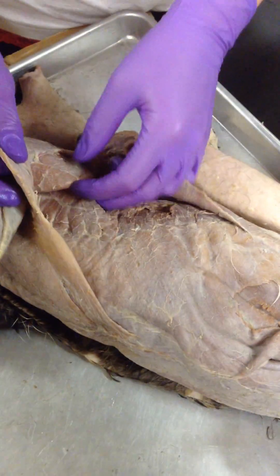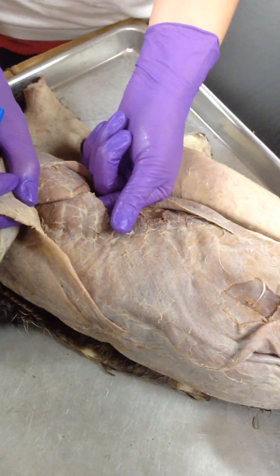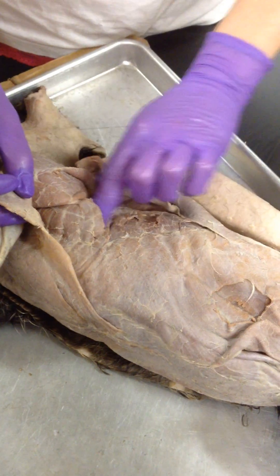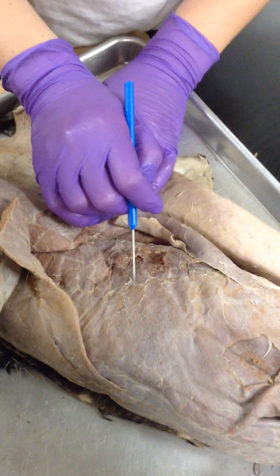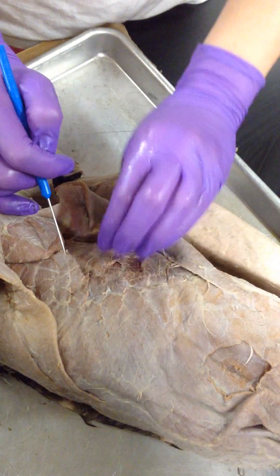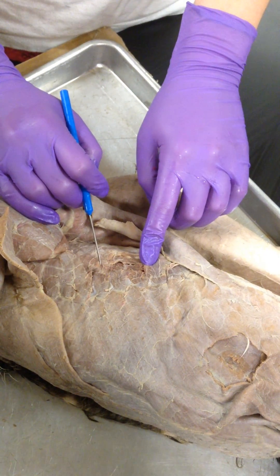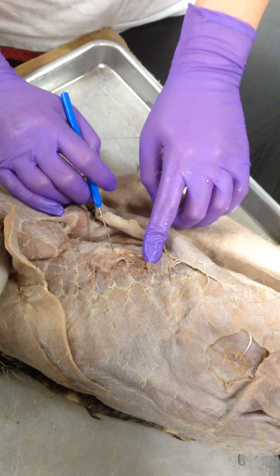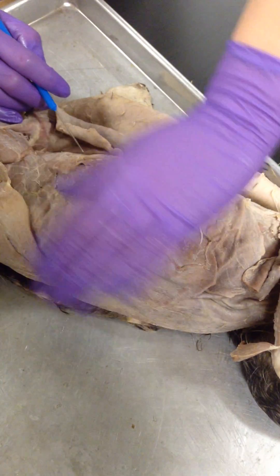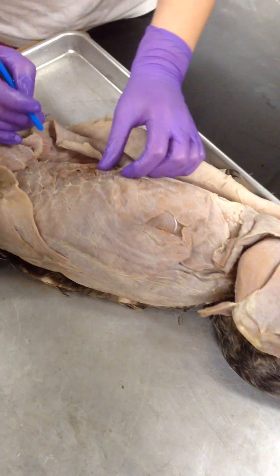Underneath the latissimus dorsi, this here, this flat — my fingers underneath — that's your serratus ventralis. And underneath that, down into here, you can see this line right here. It's like a squiggly zigzag line. These above it are your external and internal intercostal muscles. And beneath it, this down here — your external, all of your obliques: external, internal, and your transversus. You can't really see the spine.